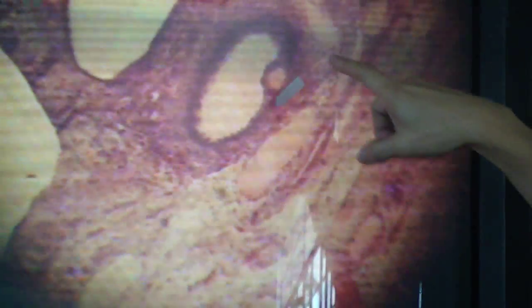For the ovary, you'll study this when you study oogenesis. This time you study only the cells that surround the follicular cells. So these are at low power. These are follicular cells.